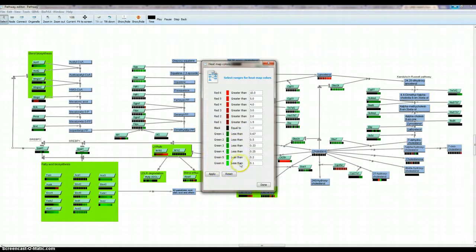Yeah, so the lighter green, I guess, is still the smallest. Yeah, the greater decrease. Gotta make sense of it there, right? 0.1 is a greater decrease from 1 than is 0.67. Is that correct? Yeah. 0.1 of this value is going to be less than 0.6 of this value. So the lightest green is the greatest decrease.